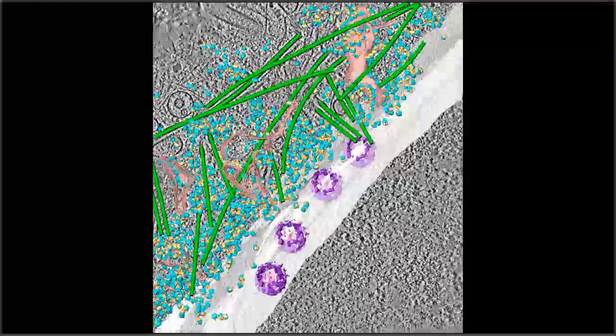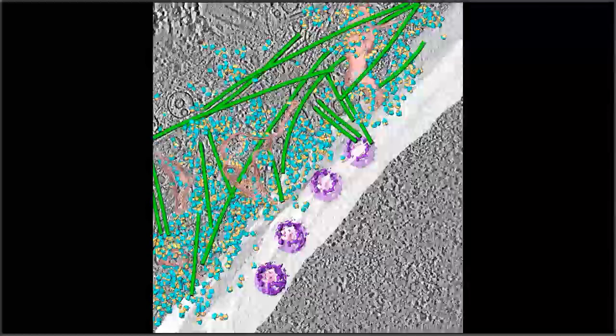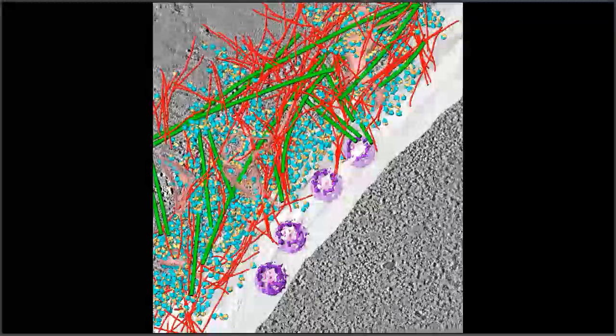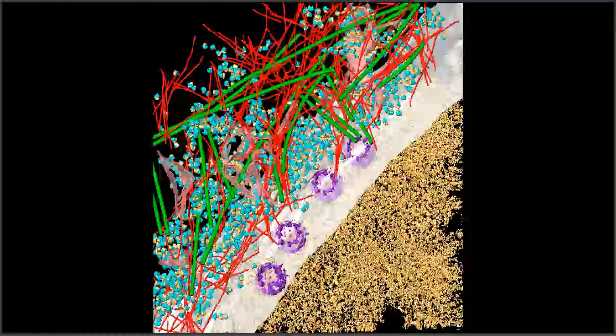Indeed. And so we've actually found a spot in the cell where we've used an ion beam or a laser to basically blade away the surface to get thin enough for the electron beam to go through. And now we're imaging really material that is diffracting the electrons based on the carbon, nitrogen, oxygen that are the biological molecules. So what we're seeing is the true biological materials.